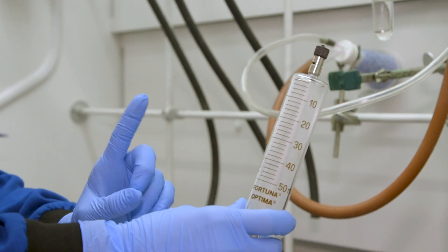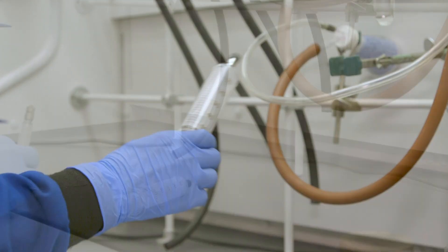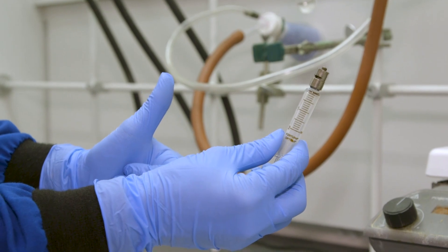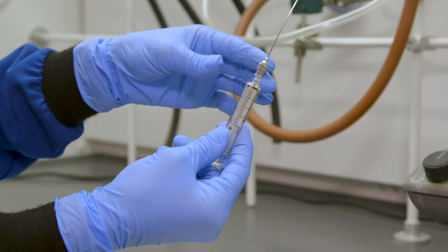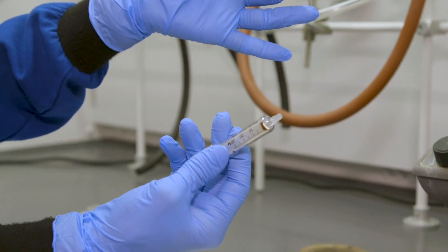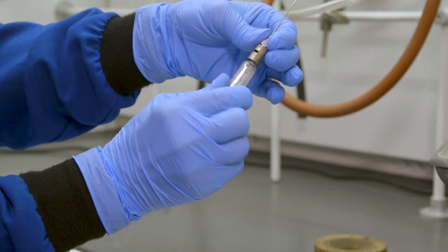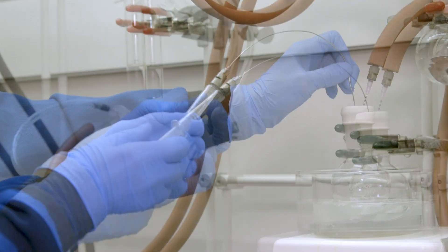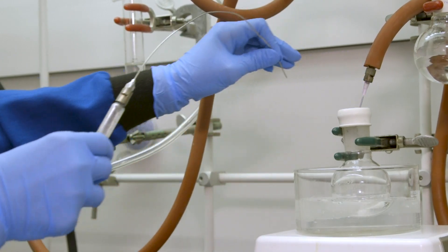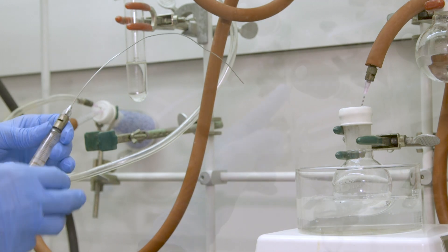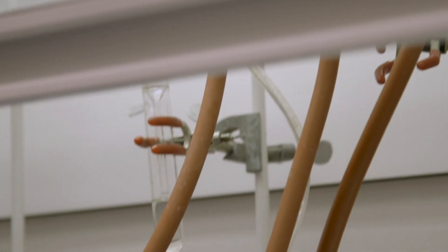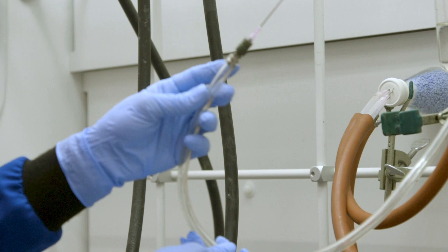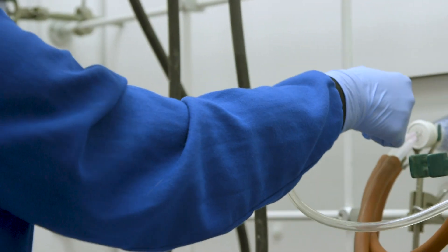Syringe transfers are used to transfer small quantities, no more than 20 milliliters of a pyrophoric liquid. The syringe must be capable of containing twice the volume being transferred. Never use a non-locking plastic syringe and needle. A backup syringe should be stored nearby in case it is needed. Any syringes used to transfer dry solvent or reagents should be flushed at least three times by drawing in inert gas and expelling the gas into the fume hood. Needled lines supplying argon to the apparatus could become contaminated or cause needle sticks if left free hanging inside the hood. These lines can be safely stored in a septum-sealed desiccator.